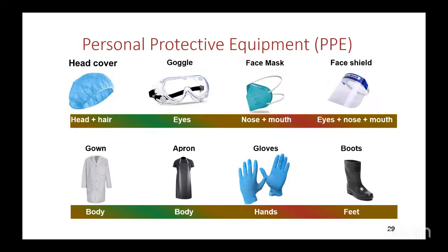Now we have said it in our previous session. You don't work with your bare hands. You have to put on your PPE. Some bad laboratory practice, or bad clinical laboratory practice, is seeing people carrying samples with their bare hands. Instead, you hear all manners of things. It's not today.